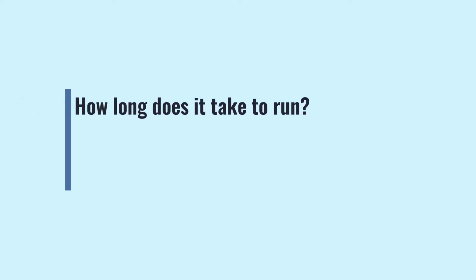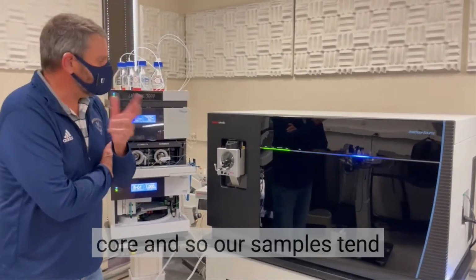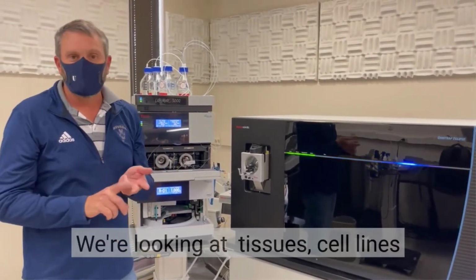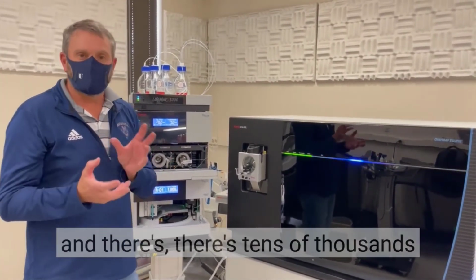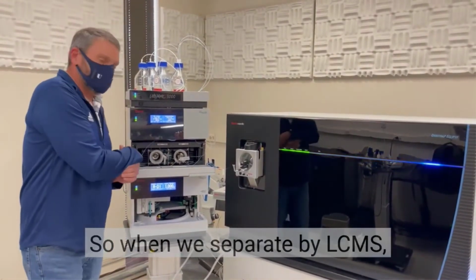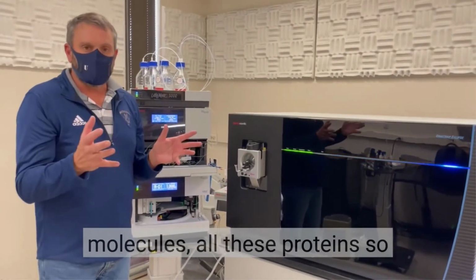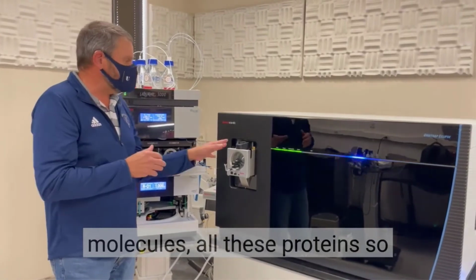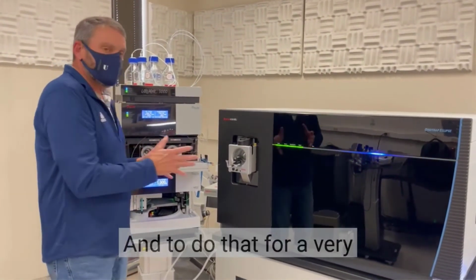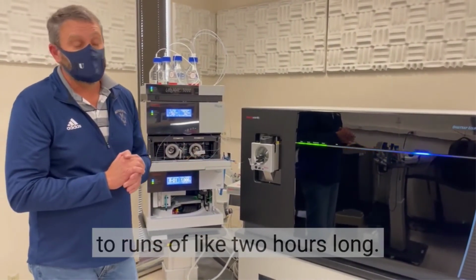How long does a sample take to run? So we are in a proteomics core, and so our samples tend to be extremely complex. We're looking at tissues, cell lines, and there's tens of thousands of proteins in a given sample. So when we separate by LCMS, we're able to separate all these molecules, all these proteins, so that the instrument has plenty of time to actually analyze it. And to do that for a very complex mixture, it can take runs of up to 2 hours long.